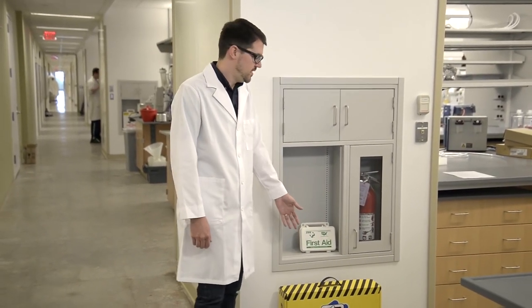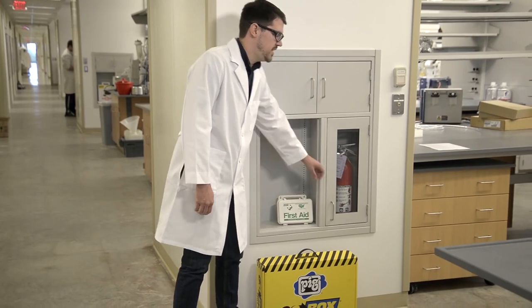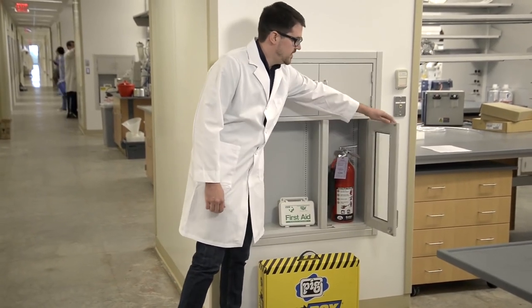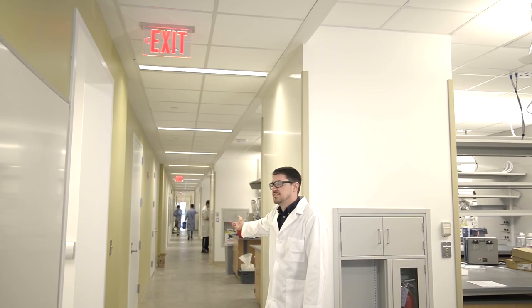Before beginning work in the laboratory, it's important to locate the following items: your spill kit, your first aid kit, fire extinguisher, and the closest and any alternate exits.